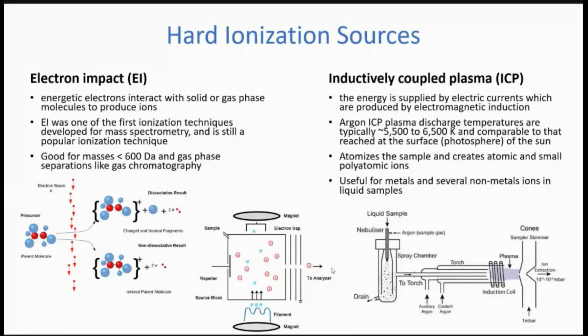All right. So what this ionization source looks like in practice, it kind of reminds me of a sideways rotovap in its look, because there's a lot of glass inside of glass in these torches with this induction coil, although the induction coil is not the same as the condensation coil. But anyway, for those of you who are chemists, this will make sense. For those of you who've never seen a rotovap, this won't make a lot of sense. But anyway, I'll start over.